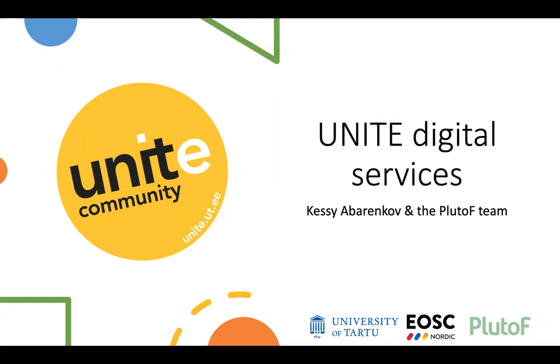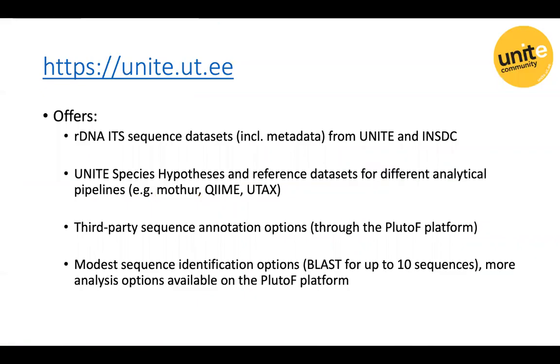Taxon and species hypothesis, the theoretical background, and I'm going to show UNITE digital services or analysis programs that we have available. And I guess you all are familiar or at least have heard about the UNITE database, and it offers ribosomal DNA ITS sequence datasets from UNITE and international nucleotide sequence databases. And it all offers on its homepage UNITE species hypothesis reference datasets for different analytical pipelines, and also third-party sequence annotation options through the PlutoF platform.